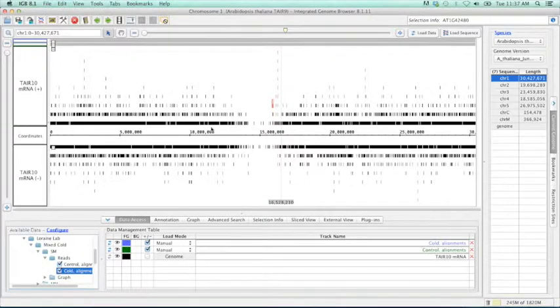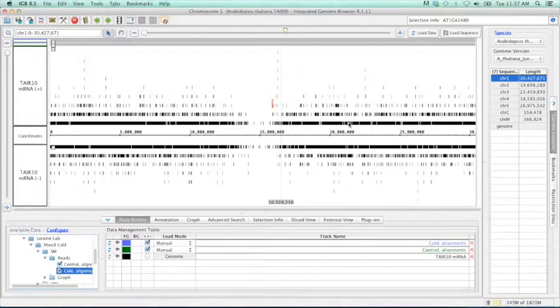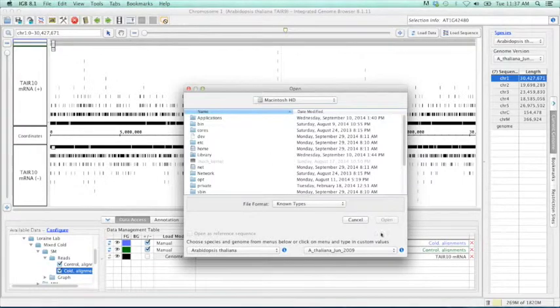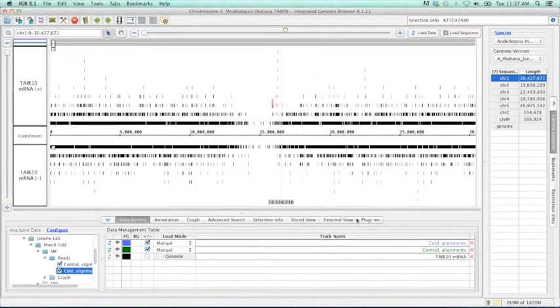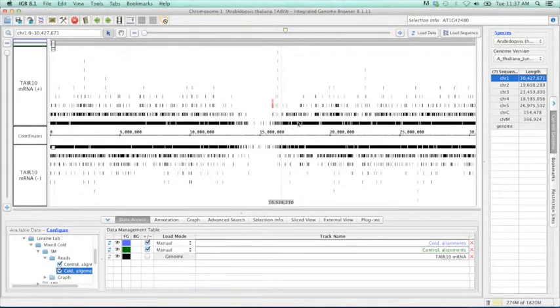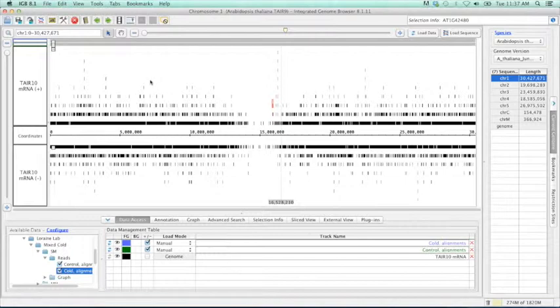The quick load site that we loaded this from has many files, and anyone can create their own quick load site. In addition, if you have files on your local computer, you can go ahead and just open them through the open function here, or even simpler, you can just drag and drop those files straight into IGBI.